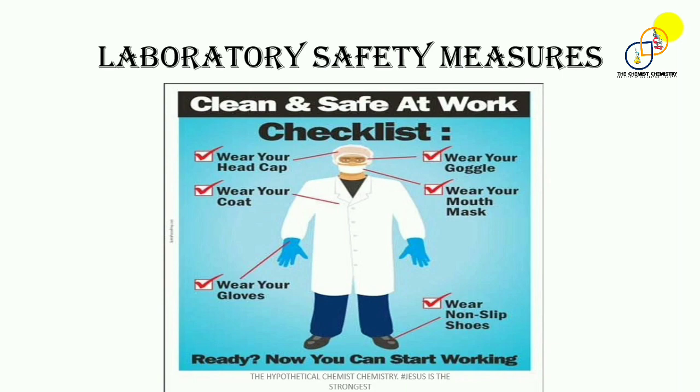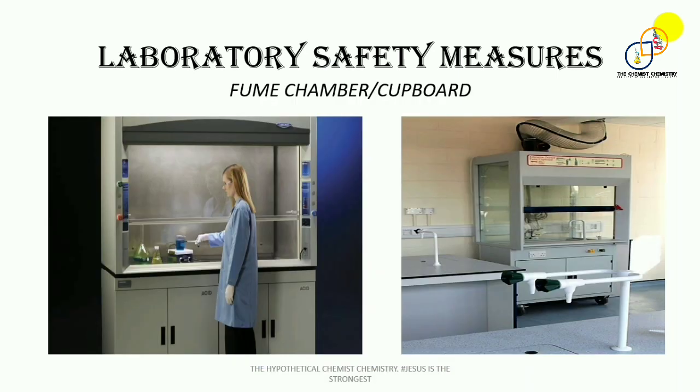So the picture here is giving us a mental idea of how we should dress anytime we find ourselves in the lab to perform any experiment.